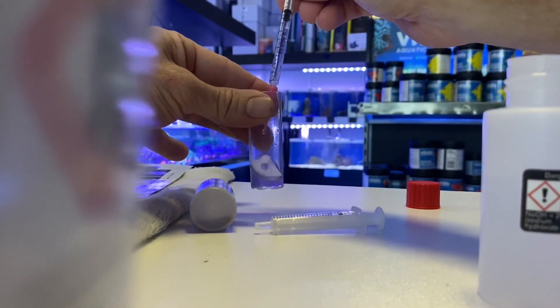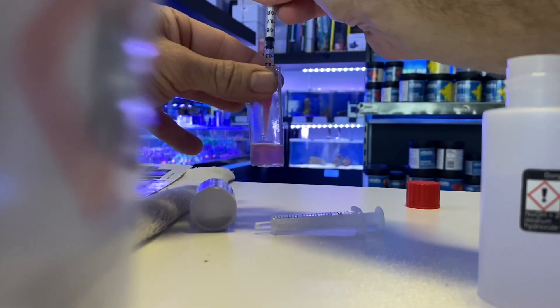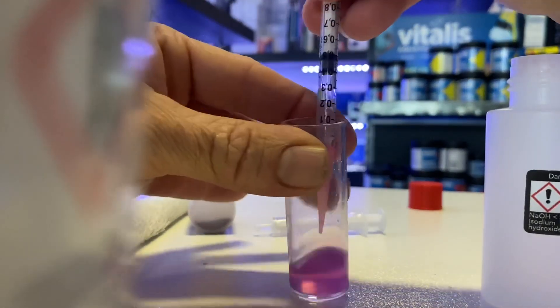You add it, add it, add it — down, down — until you get to 0.04 left. And you can see when I got to there it had turned pink.